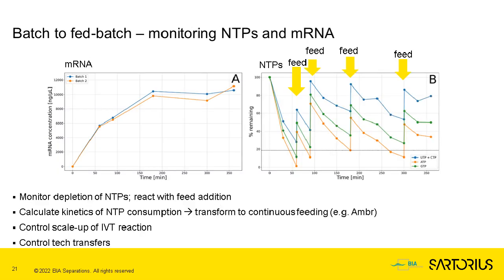And the second paradigm is, of course, feeding the reaction. Now, what are we going to feed and when are we going to feed it to increase productivity? That's quite challenging in absence of monitoring tools, but with a monitoring tool that gives a response within 3 minutes of injection, that becomes more feasible. And so we can actually turn the reaction from standard batch to a fed batch reaction by carefully monitoring the rate of consumption of NTPs.